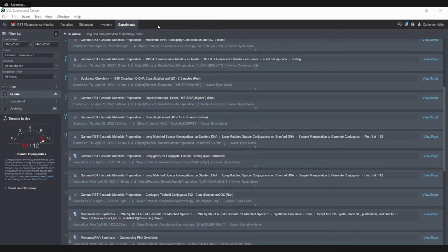That's awesome. So how close are you to actually, could I take Woodward's synthesis of strychnine, for example, and run that? The biggest limitation right now on reactivity is we're only doing low energy stuff at the moment. If you do bioconjugations and that sort of thing that you could do in a liquid handler, it would be happy. There's a bunch of bigger, more serious reactors sitting in the corner of the lab right now that are on our to-do list to bring online.